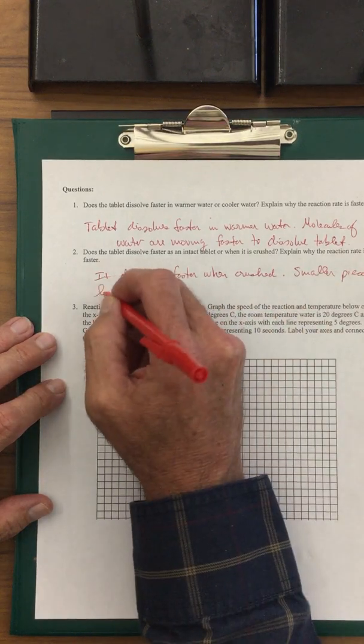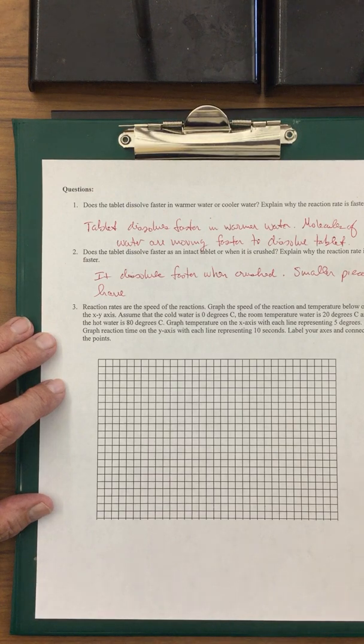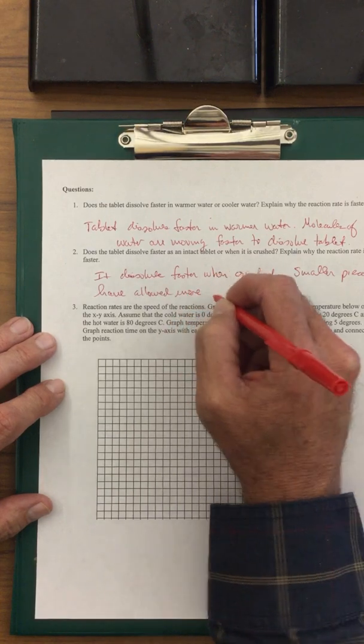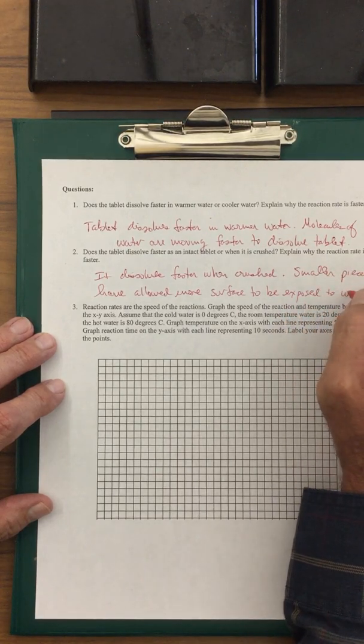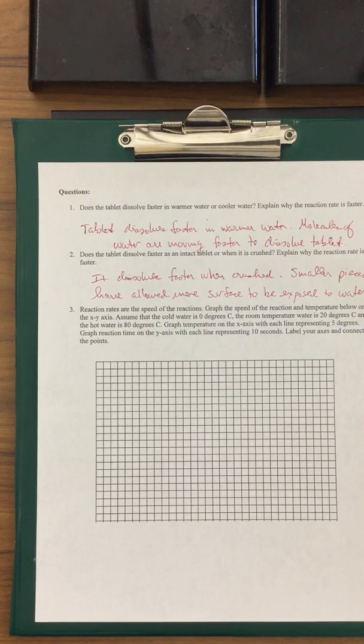Smaller pieces have allowed more surface to be exposed to the water. It dissolves faster when crushed. Smaller pieces have allowed more surface to be exposed to water. And again, the more surface that you have, the more the water is going to react with that tablet. So reaction rates are the speed of the reactions.